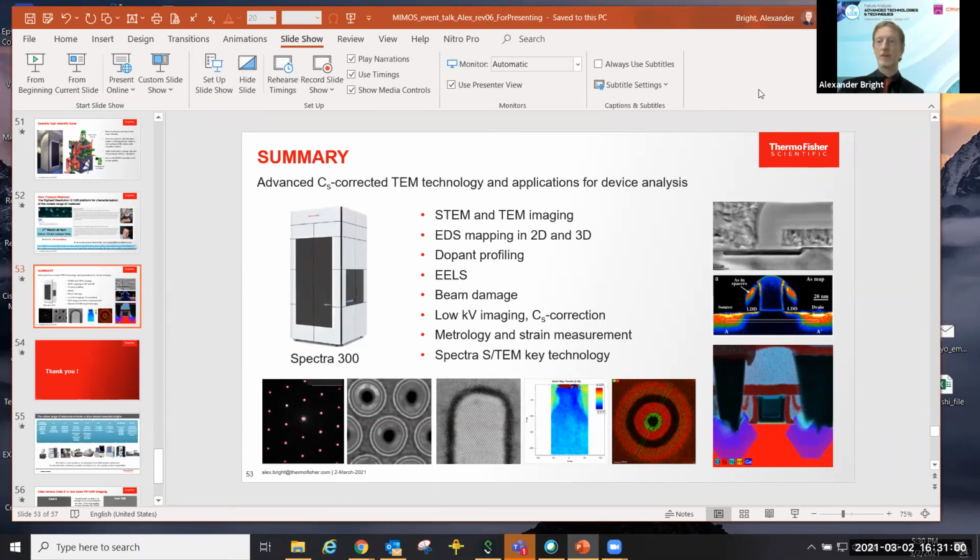Right. Of course it's difficult, and I think you can try changing the balance between the current and the acquisition time. That actually sometimes makes a significant difference. So you try to do a longer mapping with a lower current. That can work. Of course, the biggest difference probably comes from the sensitivity of the EDS detector you're using.